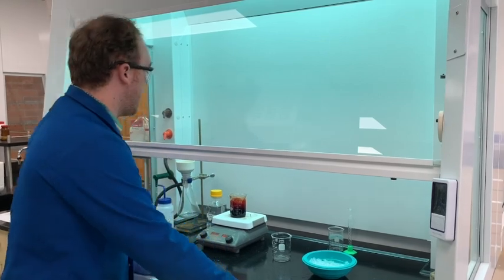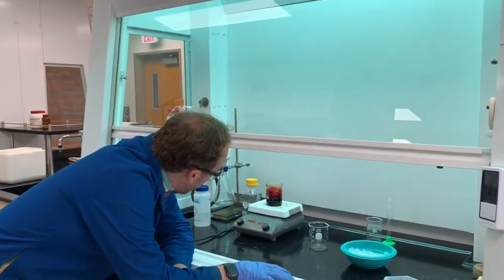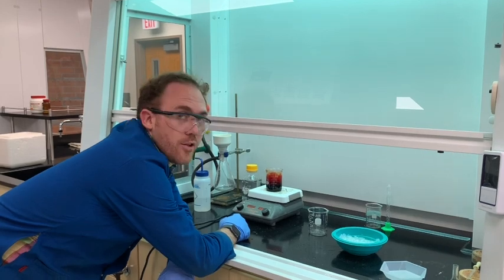And so we're going to let that heat for a second, try to dissolve as much as we can. And then we're going to throw it into this ice in order to precipitate it out. Just another recrystallization.